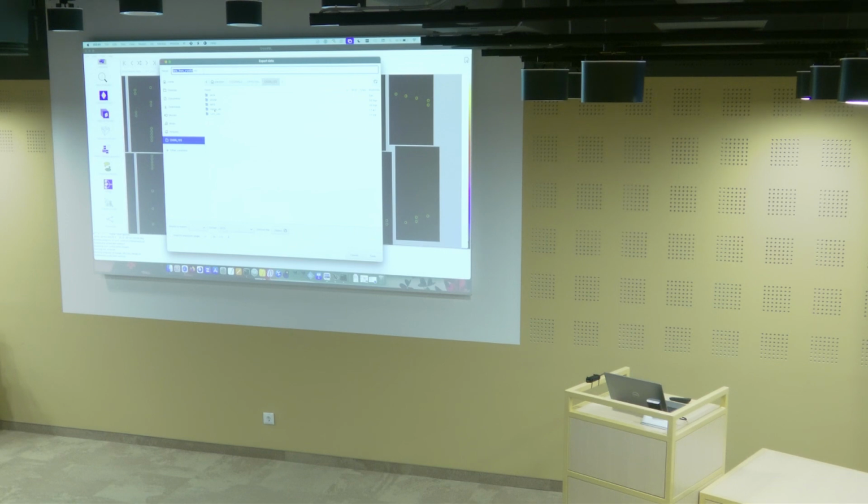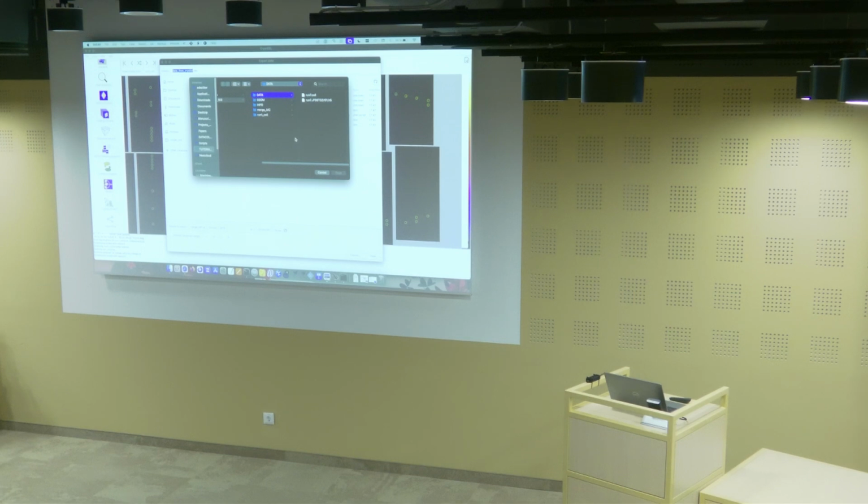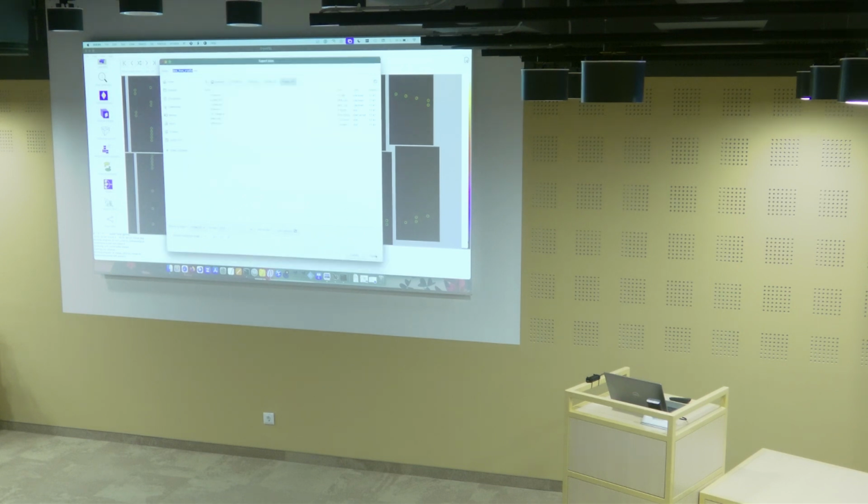So this is data from CrystFEL. We want our merged data from Monte Carlo merge. And you want mostly to have that in a format which is called MTZ, which is the format that can be used by other programs later on. We're going to give it the unit cell information, the one from our run. And then we're going to save that file.